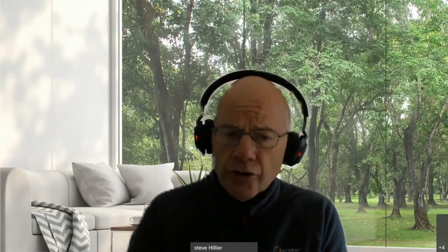Thanks, Jean. And XRD? Yeah, for XRD, typically we need a larger sample than the other two techniques, particularly if we want to do quantitative analysis. So we're into the gram quantities normally. However, we can also look at very small samples. We have some special low background holders that will allow us to just sprinkle a couple of milligrams of something on there.